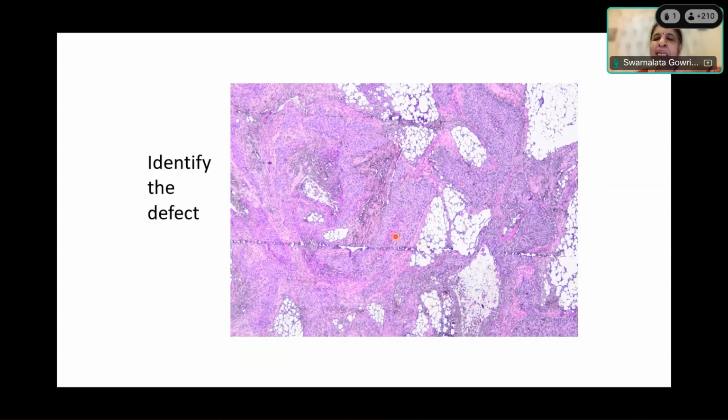And if you keep it under, the easiest way by which you can make out that the tissue is not cover slipped well, if you just keep it against the light, it should be transparent. It should be absolutely clear. You just lift up the slide, look at it against the light, and if it's opaque, then sure enough, it will be a cover slipping problem. Cover slipping or the dehydration problem I showed you in the section. Okay, so this is improper cover slipping, and that's how it looks.